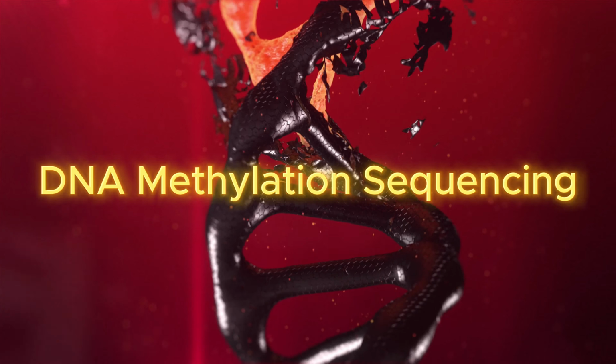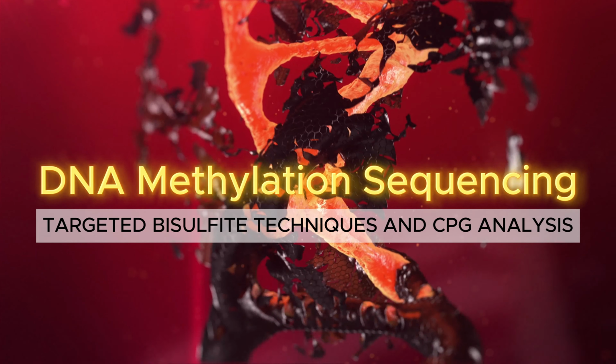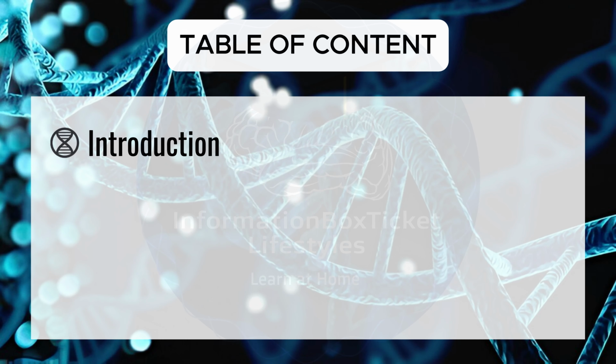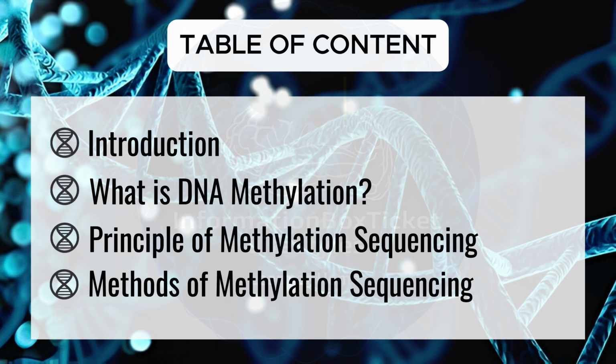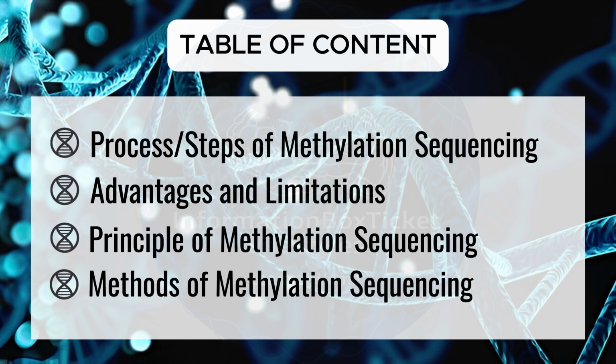Advanced DNA methylation sequencing, targeted bisulfite techniques and CpG analysis. Table of contents. Introduction. What is DNA methylation? Principle of methylation sequencing. Methods of methylation sequencing. Process steps of methylation sequencing. Advantages and limitations of methylation sequencing methods.